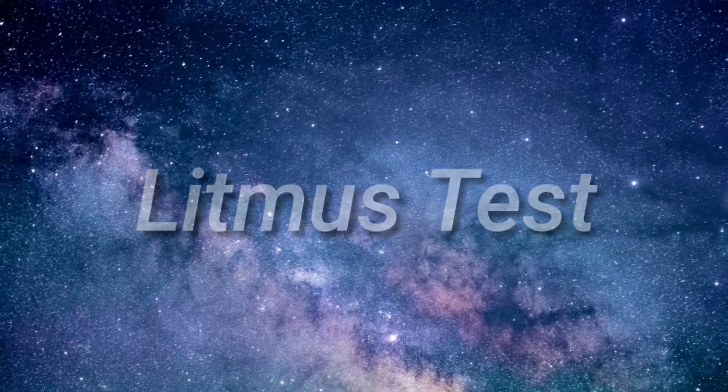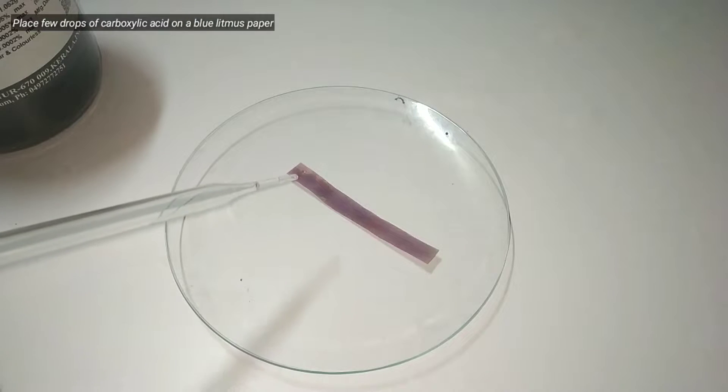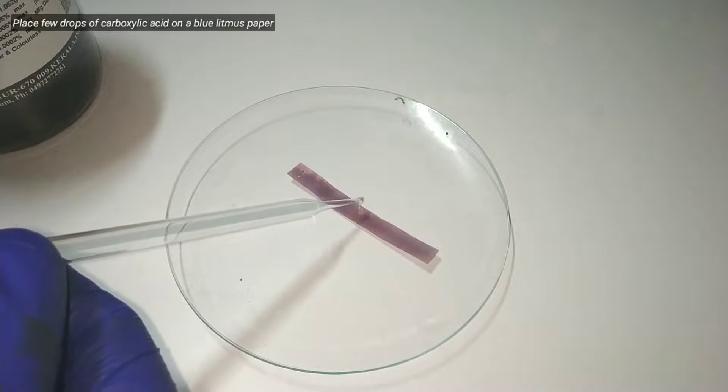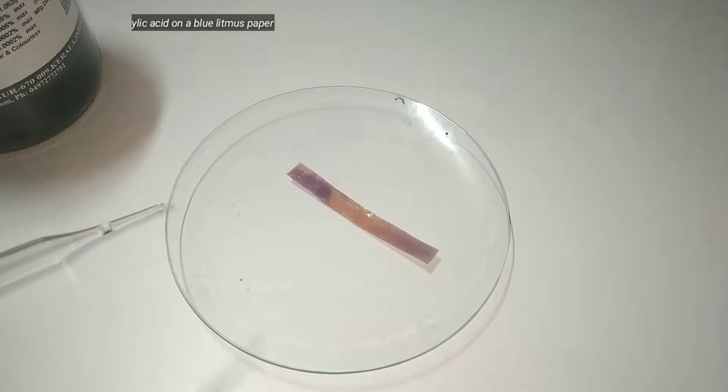Let us start with the litmus test. When carboxylic acid is dropped on blue litmus paper, it turns red, indicating that the compound has acidic properties.